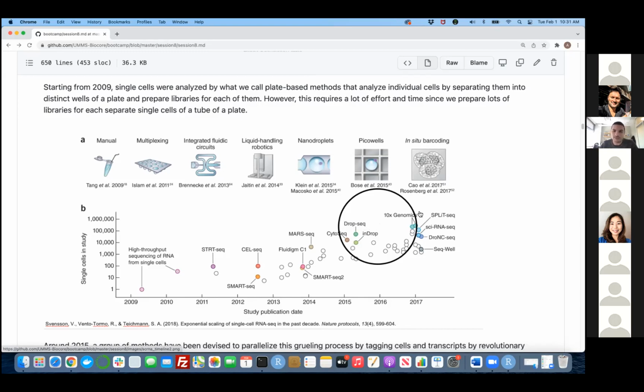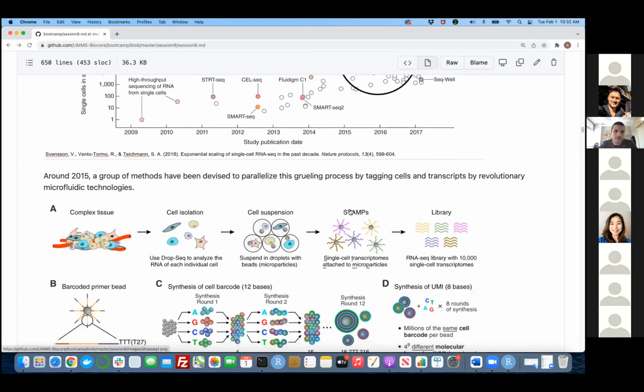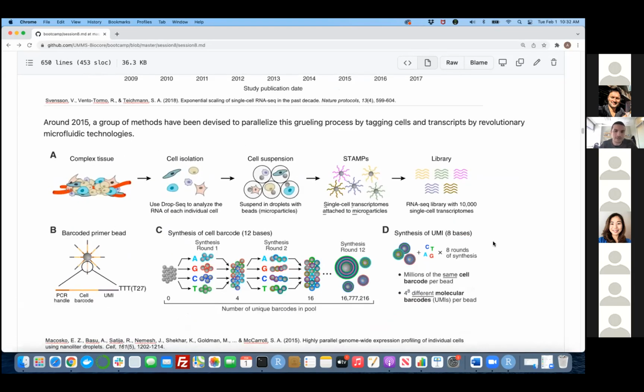But first, we're going to cover that. There are multiple methods, including Drop-seq, which is short for droplet-based single-cell RNA sequencing. It was initiated in 2015 in a group at the Broad, I believe, or the author of the first paper could be at the Broad and have a little lab over there. I don't quite remember now. Its efficiency was further increased later by 10x Genomics, and we're just going to talk about that too. So what's happening basically? Let's see Drop-seq.